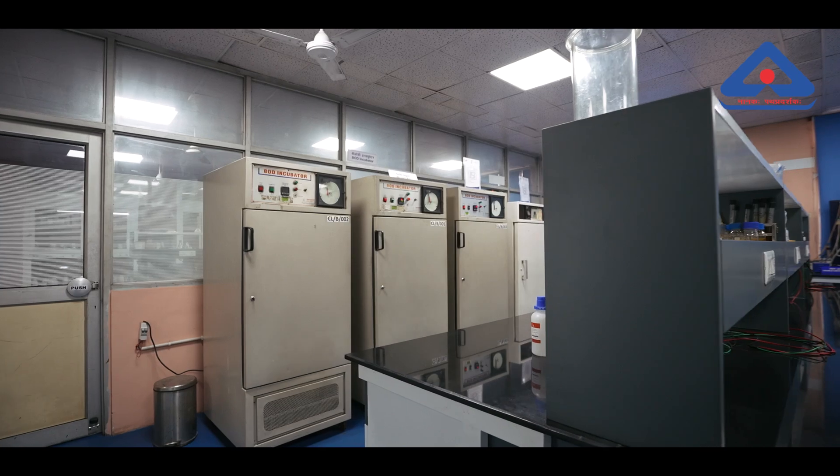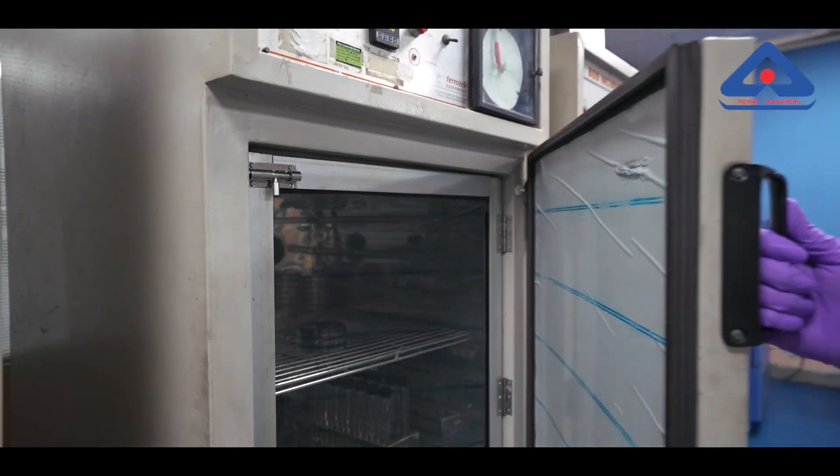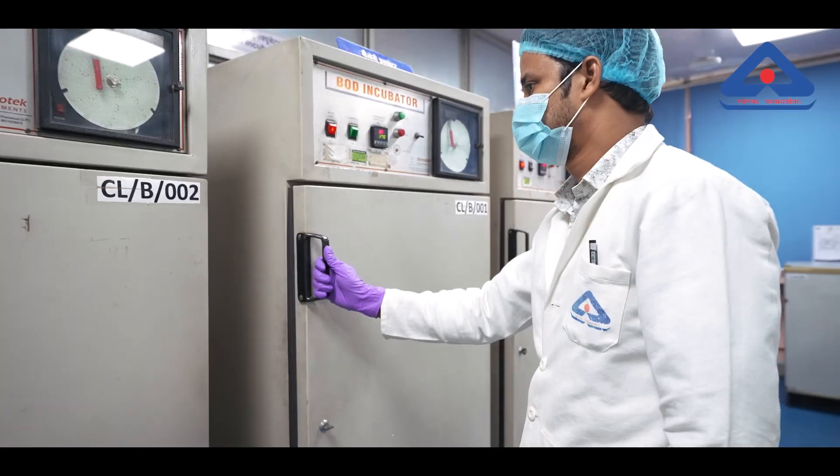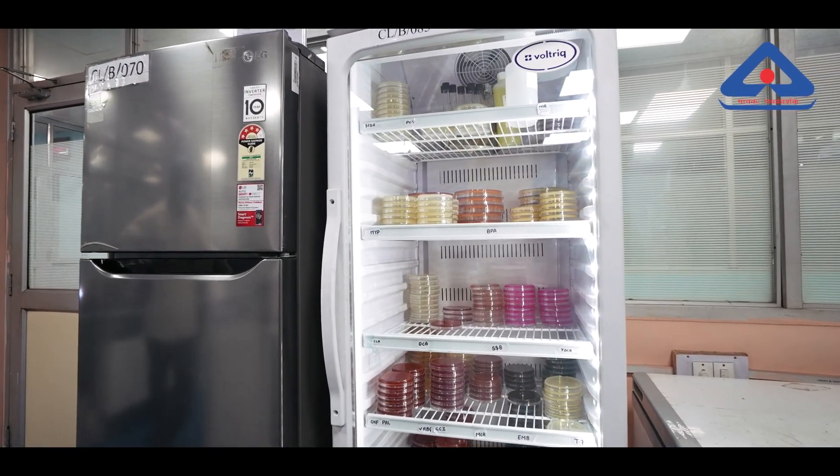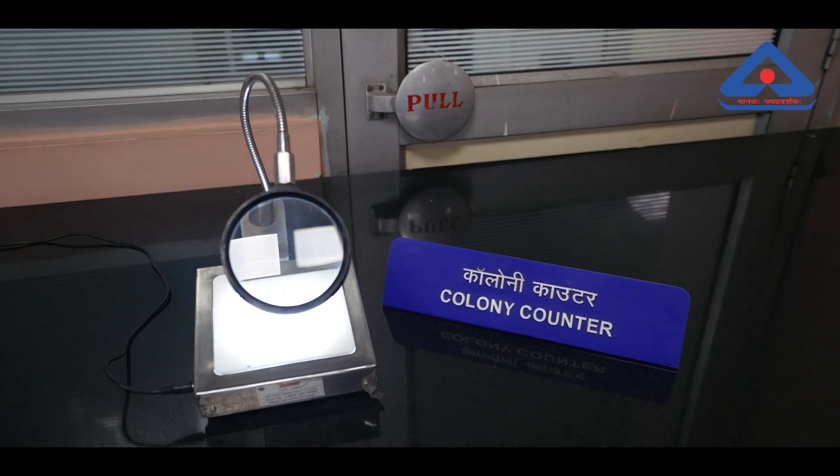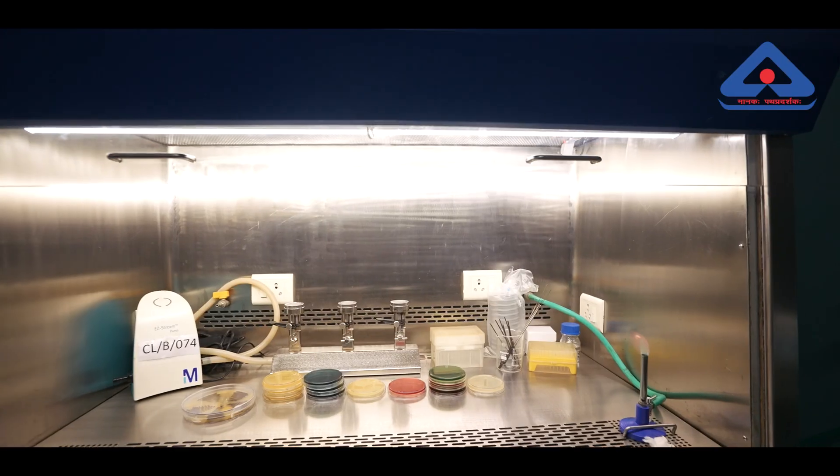After the inoculation in respective media, inoculated plates and broth are incubated in BOD incubators at specific temperatures to provide optimum growth conditions. Growth of typical colonies and counts is observed after incubation using a colony counter. After these processes and tests, ensure that every packet of skimmed milk powder you buy is safe, nutritious and high quality.